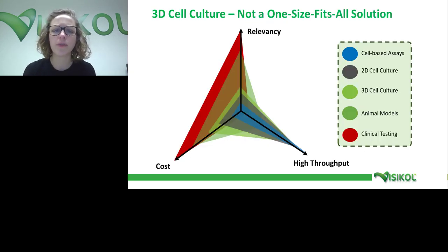But it's important to note that 3D cell culture is not really a one-size-fits-all solution. So as I touched on, 2D cell culture models can still be very useful tools.